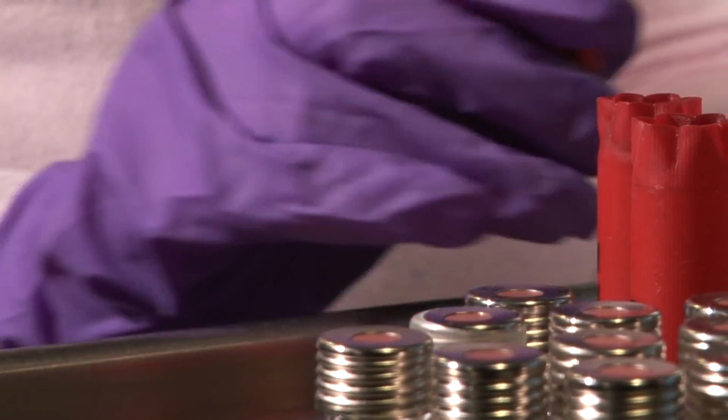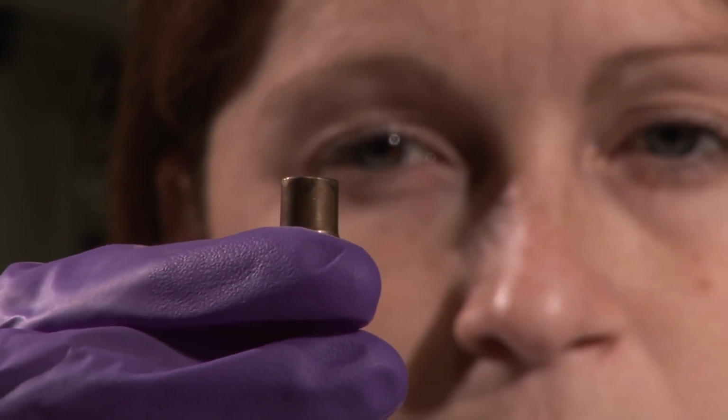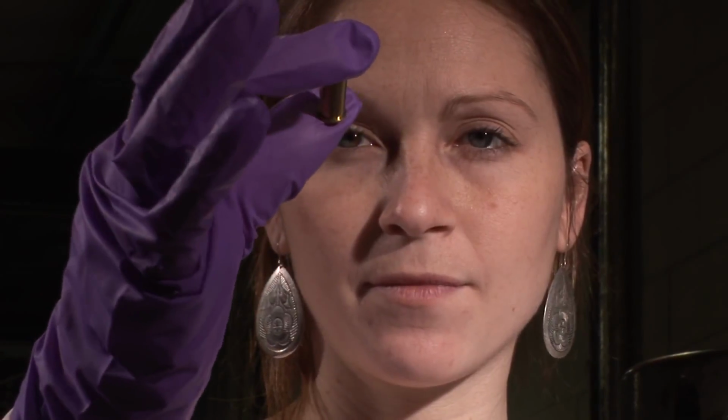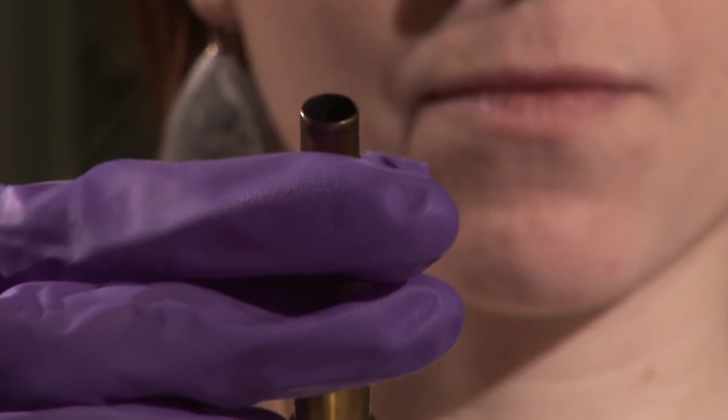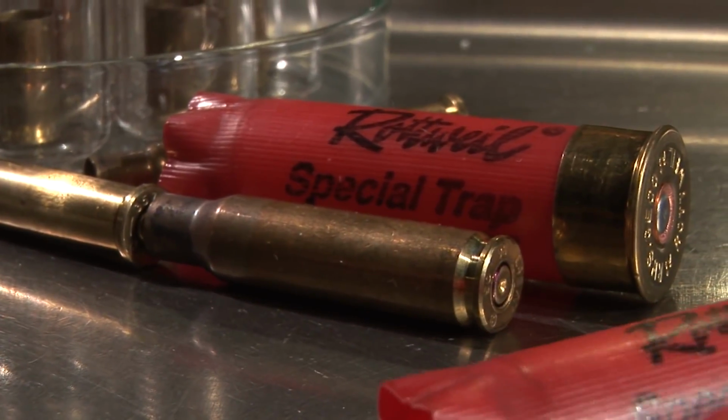The significance of this is that different manufacturers of ammunition powder use different recipes. And so ammunition powder from one source will contain different elements to that of another source. Now, with the ion beam, we can pick up differences between these different ammunition powders that you can't see using the police techniques.